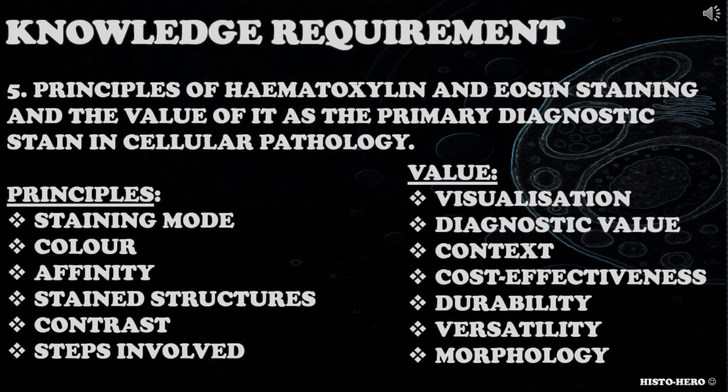When addressing this knowledge requirement, candidates should consider staining mode, color, affinity, stain structures, contrast, and steps involved. Values such as clear visualization, providing diagnostic foundation, context for further staining and baseline for advanced staining, cost-effectiveness, durability, versatility, providing detailed morphology, efficiency, and so on.